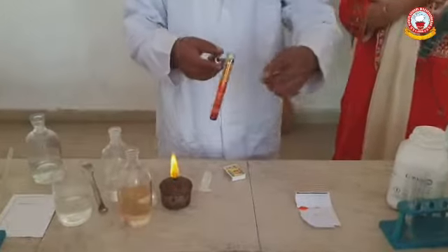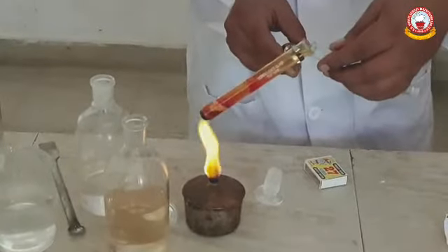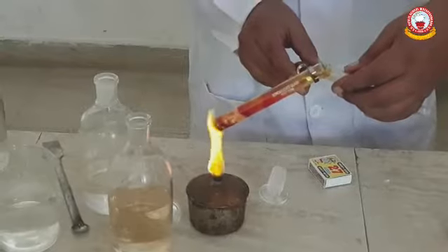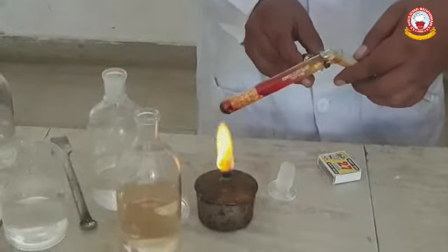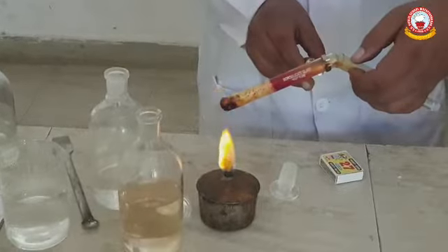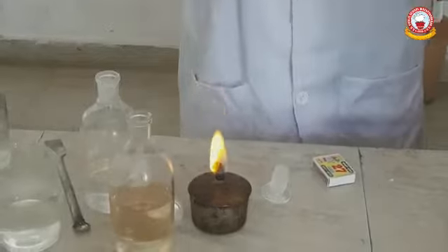These vapors are pungent, poisonous vapors. So, we have to be alert also. We do not have to inhale these gases. You can see how delicately the two are added. The liquid part should not be added, only the gas is added to the NaOH solution taken in another test tube. Children, you can see the yellow color, that is of sodium chromate.